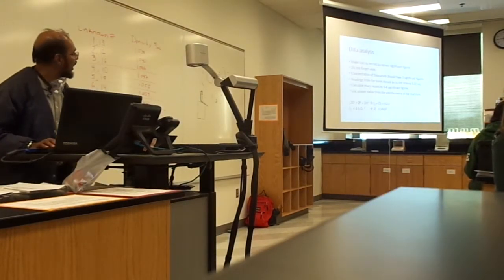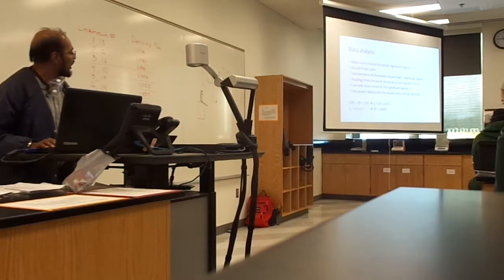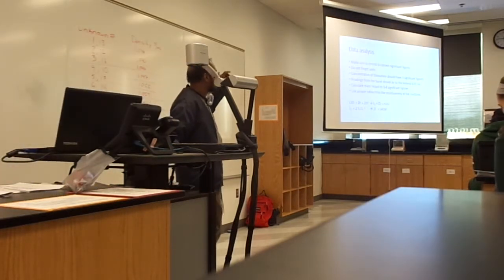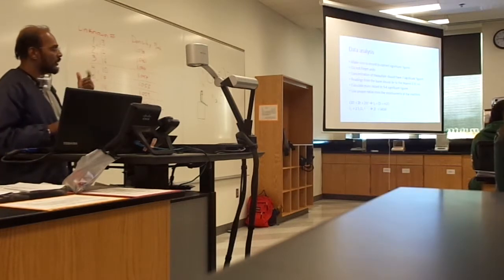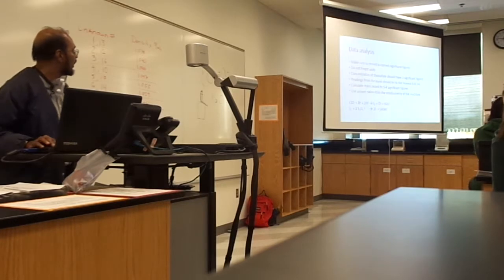And in the data analysis, always make sure to record the correct significant figures, and don't forget units. The concentration of thiosulfate should have 3 significant figures. And when you read from the burette, you should be able to read to the second decimal point. And then also calculate mass, and you can record 3 to 4 significant figures based on your calculation.